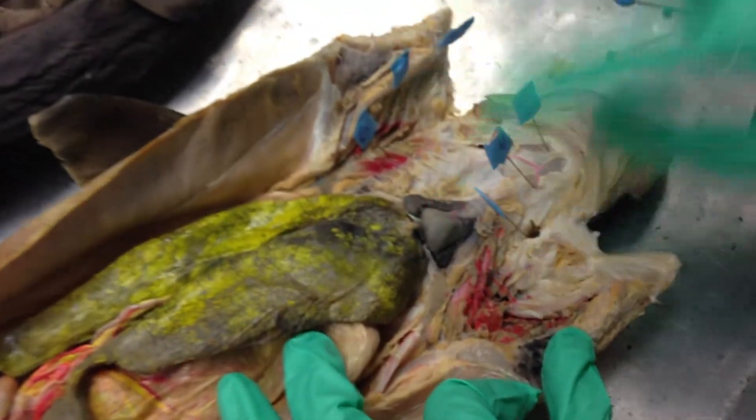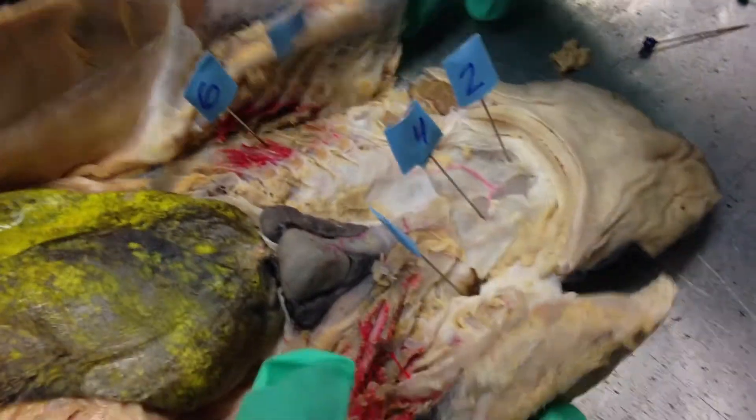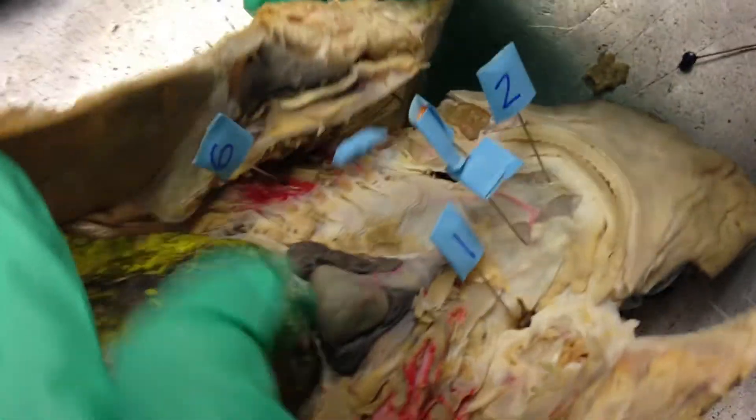The hole is right there. Number two is just pointing at the mouth area. Obviously it was dissected, and if you kind of put it back together you can see that that's the mouth area.